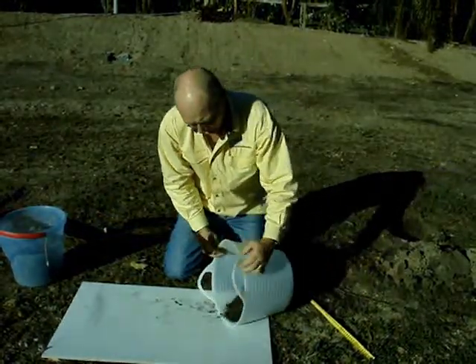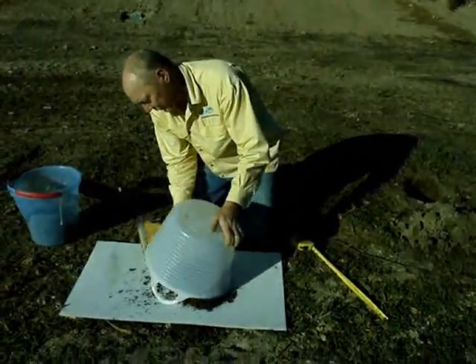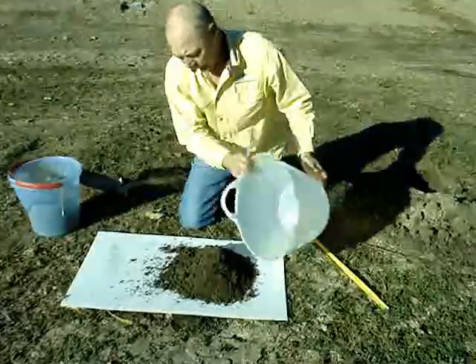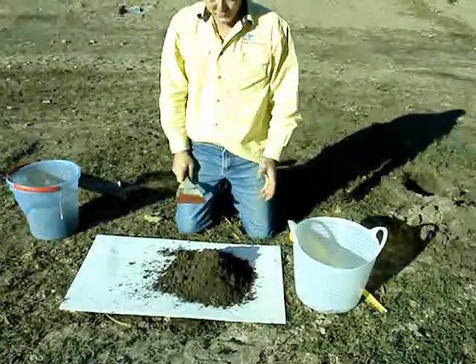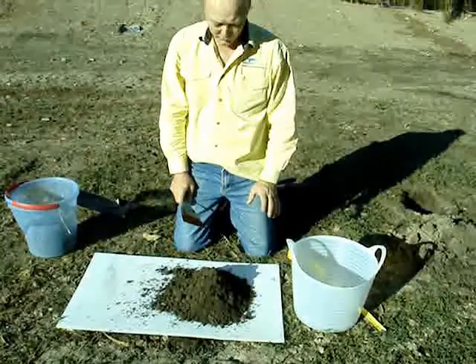The next step is to tip it out. The thing is, we only need a small amount — we only need 500 grams. So we've got packets that actually fit the right amount.